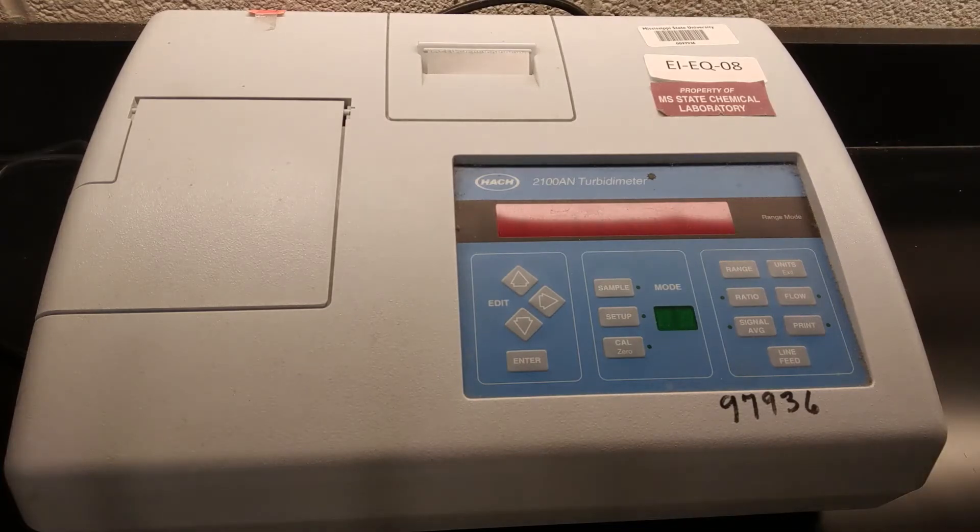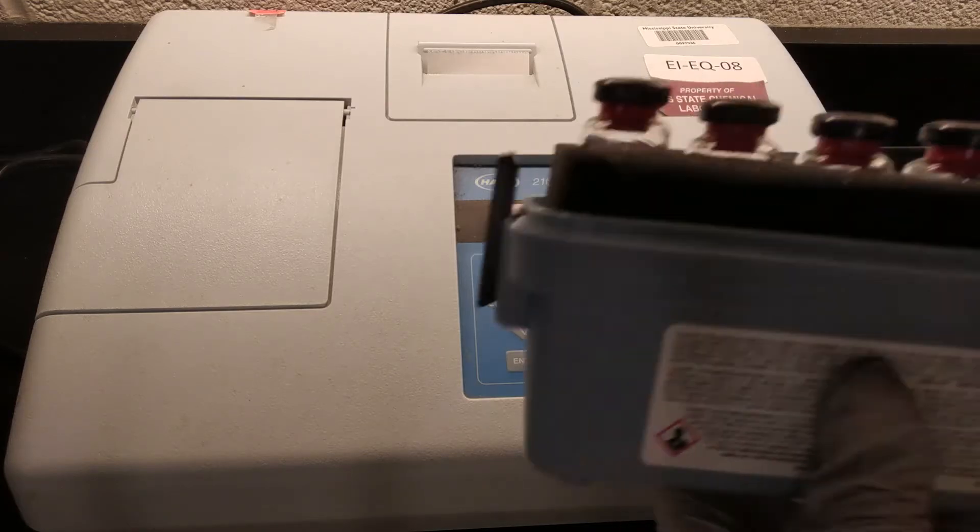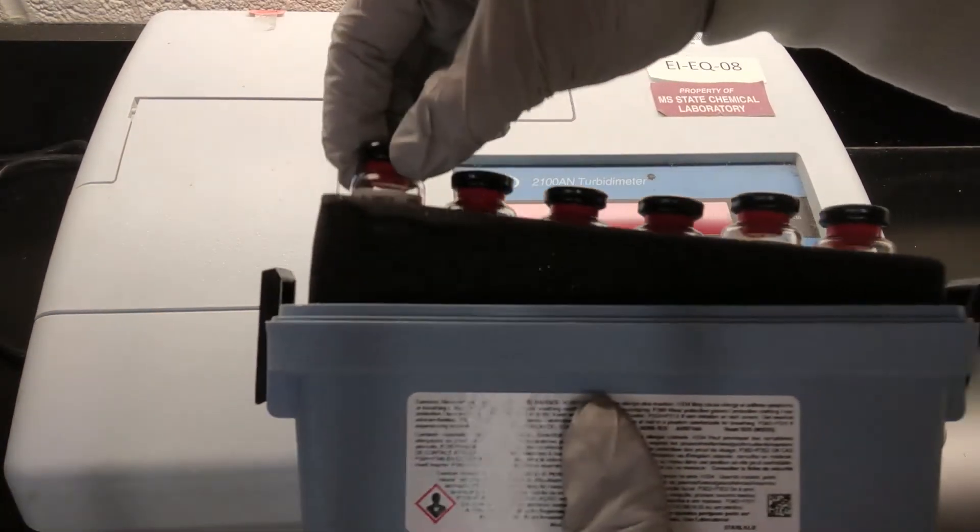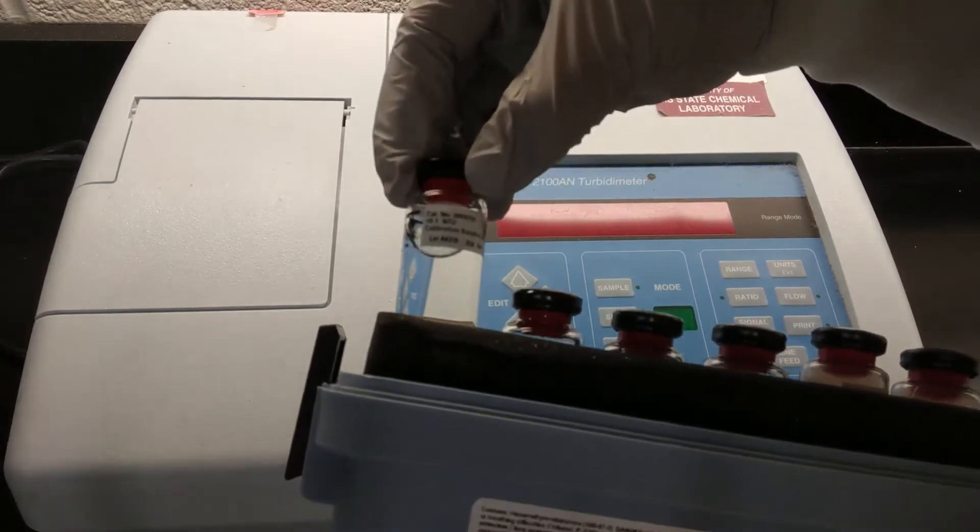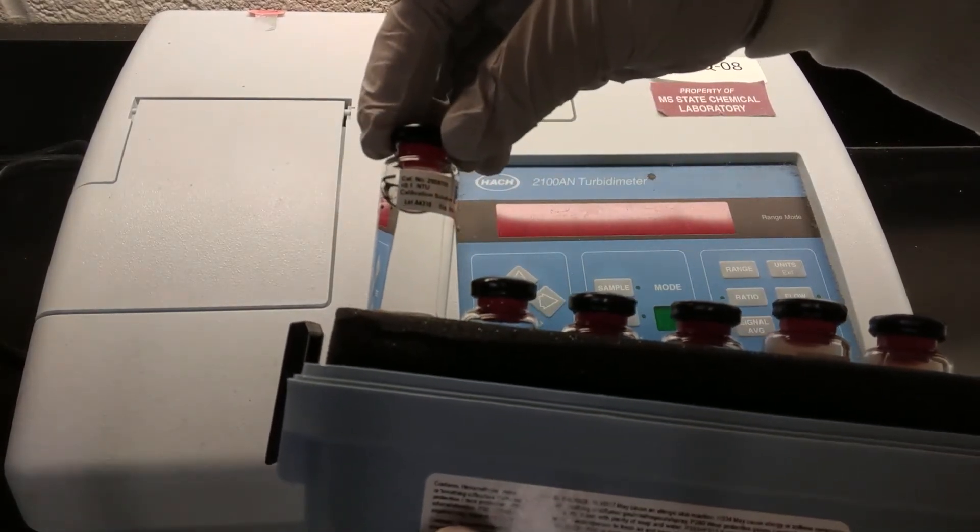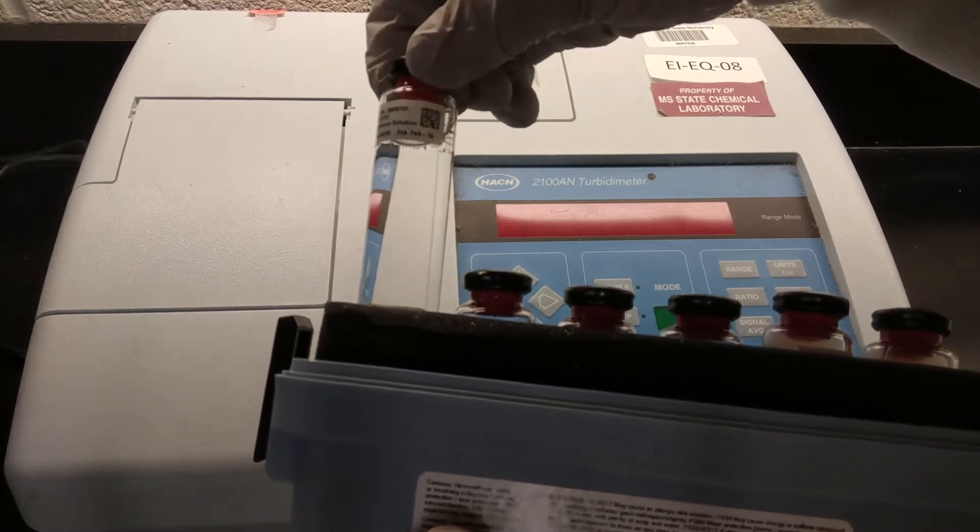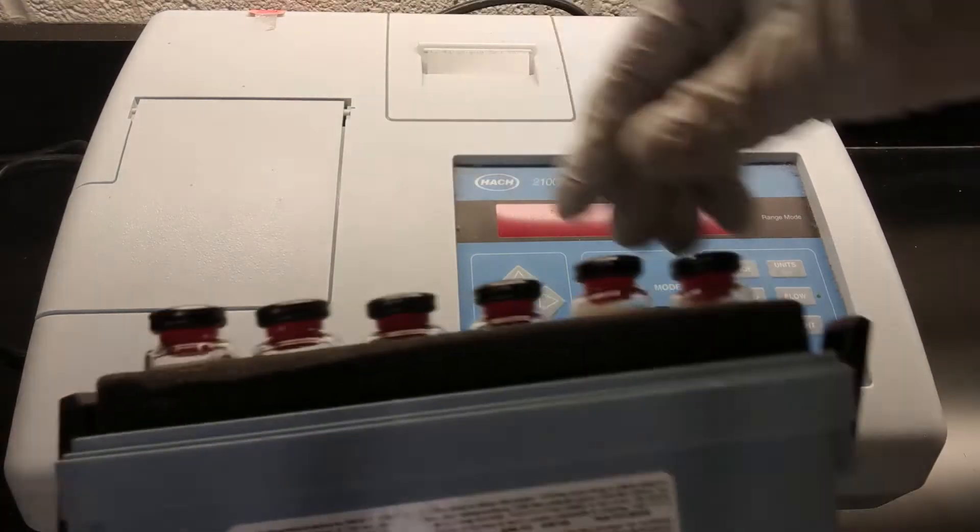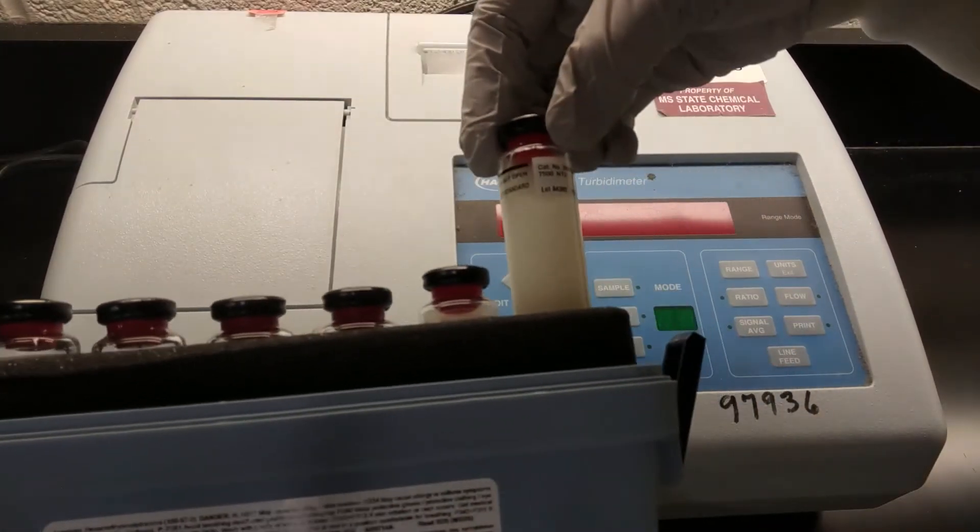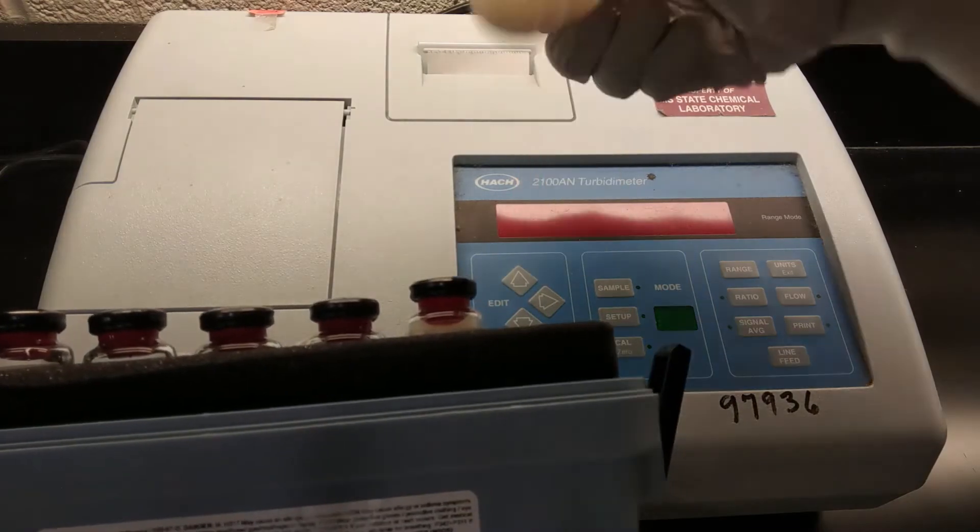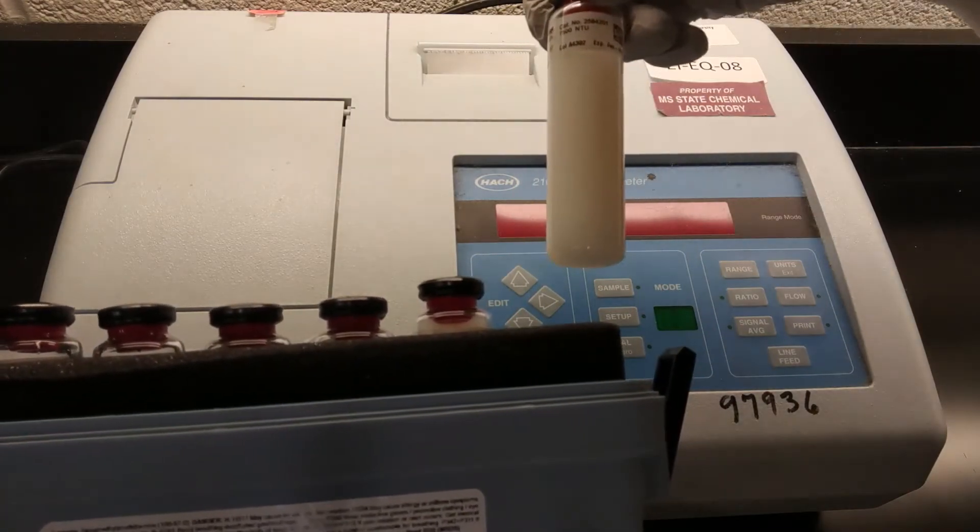And then also our calibration cells. So these are sealed containers with various known levels of turbidity. So for instance, this is our less than 0.1 NTU solution. You can see it's pretty clear versus here is our 7500 NTU solution. It's very cloudy. It almost looks like milk.